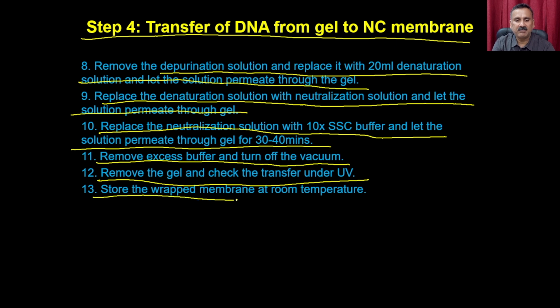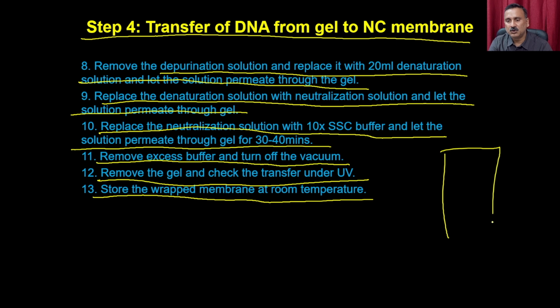Then store the wrapped membrane at room temperature, and you can check whether the transfer happened by visualizing the membrane under the UV light. It is going to show you exactly the same pattern that you got on the agarose gel.